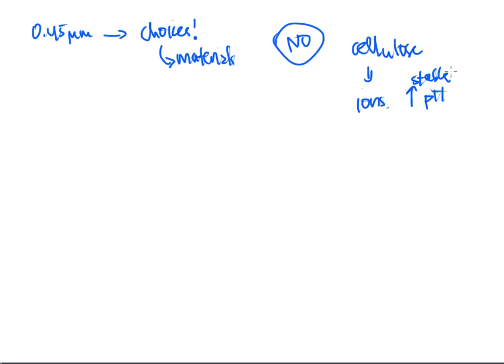So if you've made this mobile phase and you're pouring it through the micron filter, and you have chosen a cellulose-based micron filter, then you are doing more damage than good, because now all of these ions, there's a possibility that it will start to break down at very high pH levels, will start to go into your mobile phase and gunk up your system, and your conductivity could go through the roof. So say no to cellulose and you'll be okay.